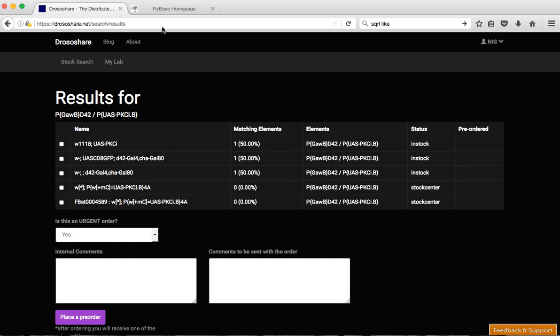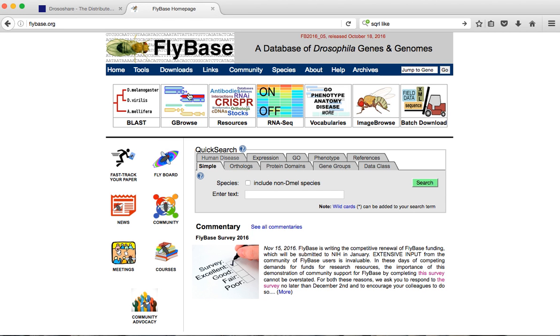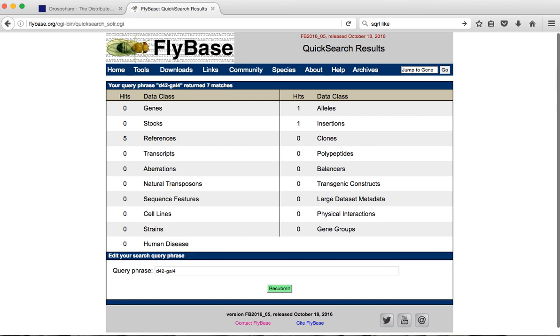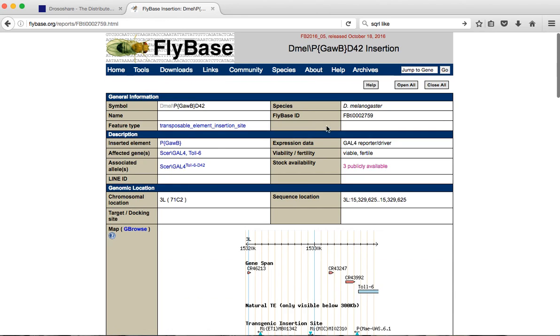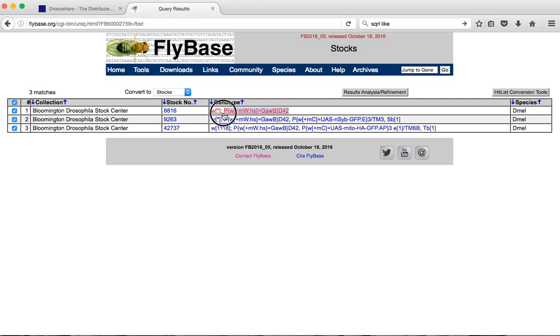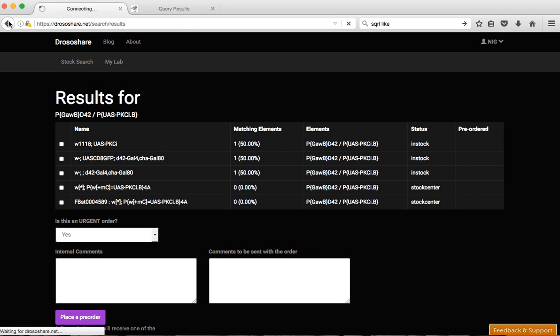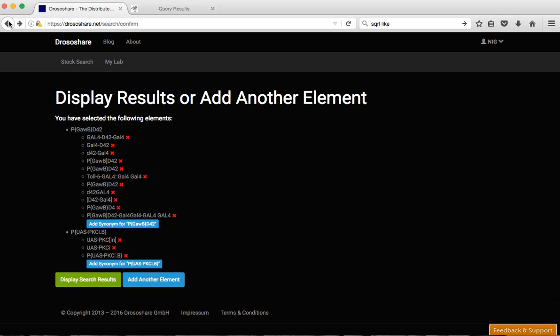You can also see that we didn't see D42-Gal4 in stock centers. So this can happen. If you look here on flybase for D42-Gal4, see that there is one insertion, it's the one we're looking for and there's three stocks available. And you see here that it's named slightly differently here, which is not in our search. So here we just go back one button and add here a synonym for D42-Gal4.